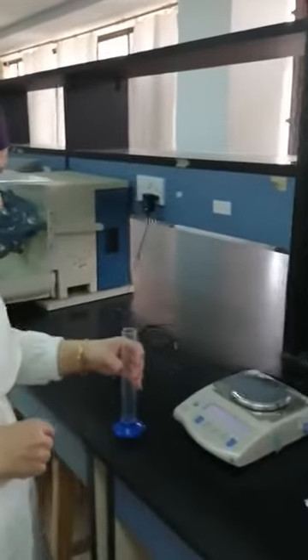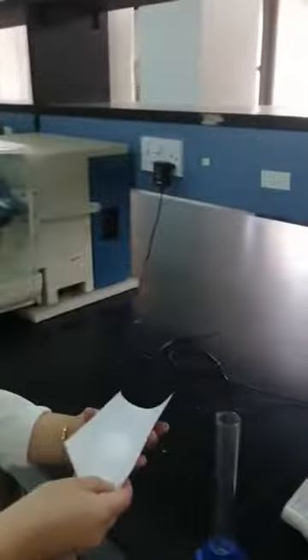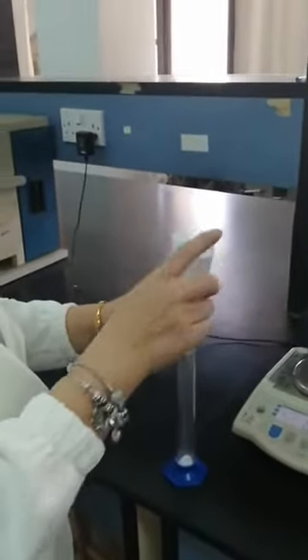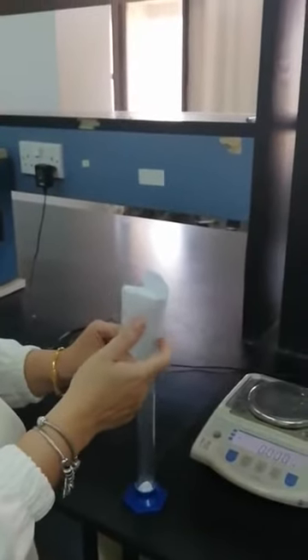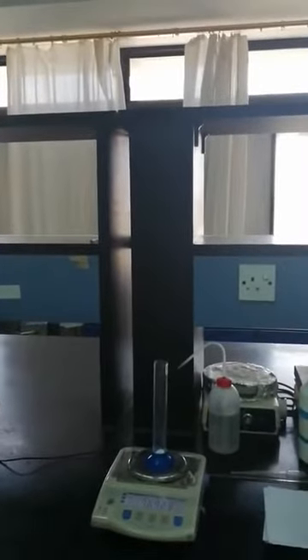Then we add 2 grams of zinc oxide inside, and W2 will be the weight of the same cylinder plus the weight of 2 grams zinc oxide.